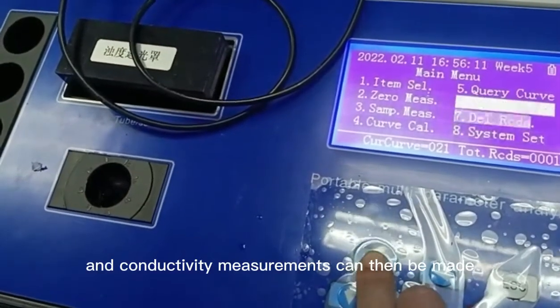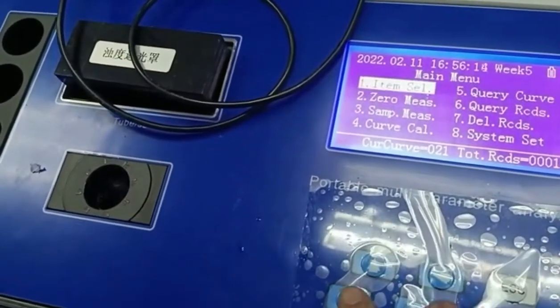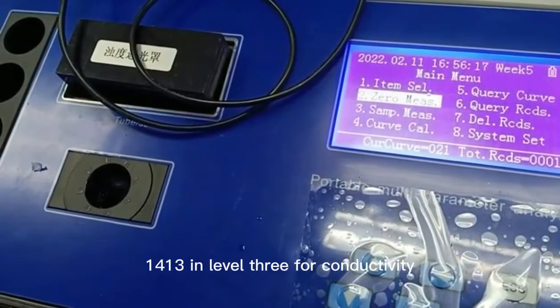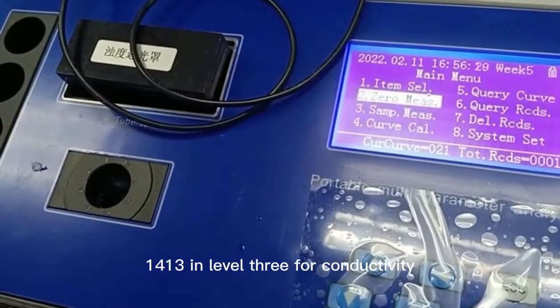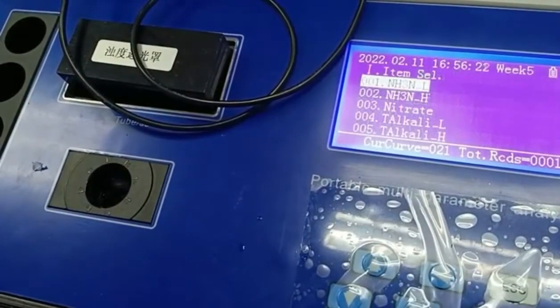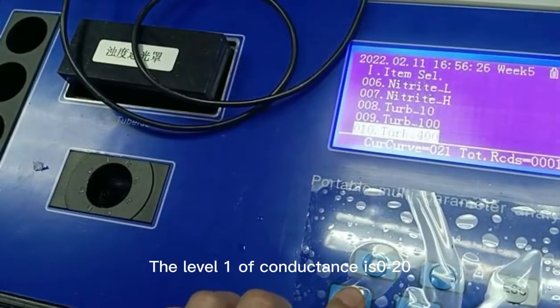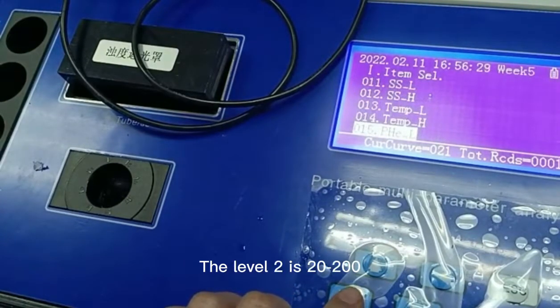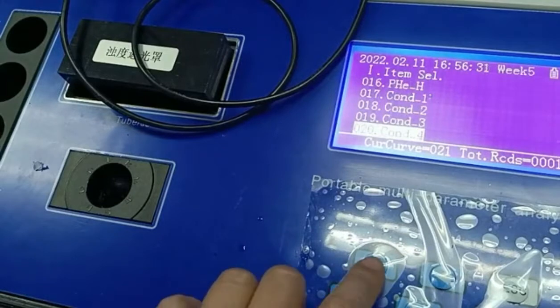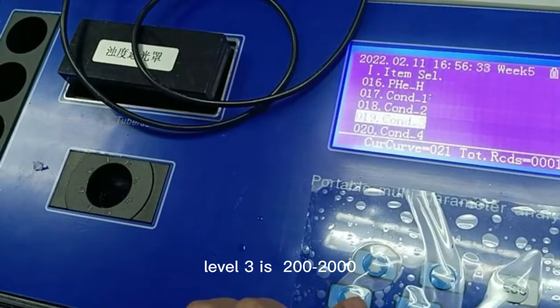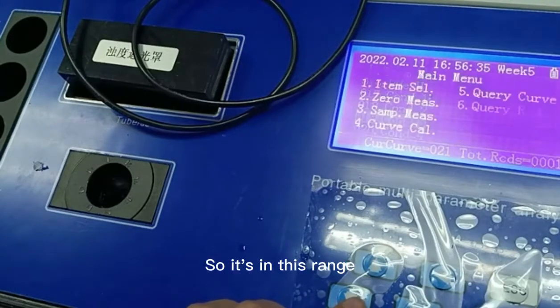And conductivity measurements can then be made. 1413 is in level 3 for conductivity. The level 1 of conductance is 0 to 20. The level 2 is 20 to 200. Level 3 is 200 to 2000. So it's in this range.